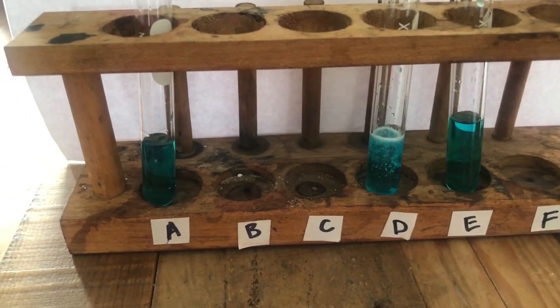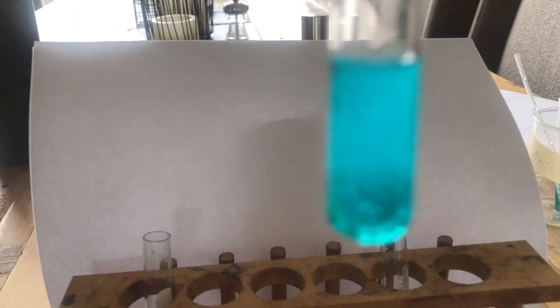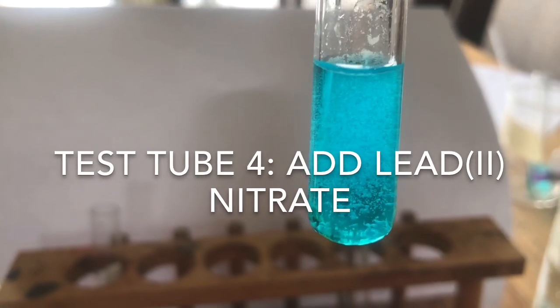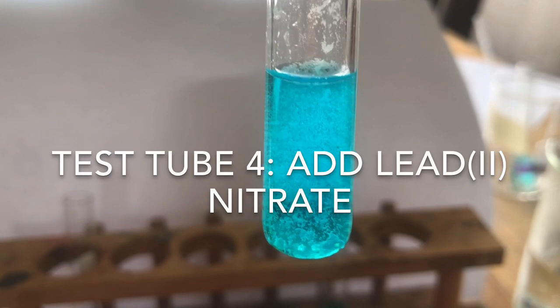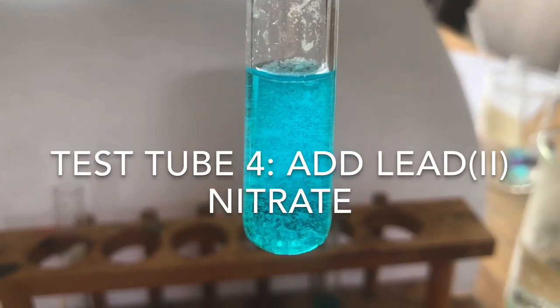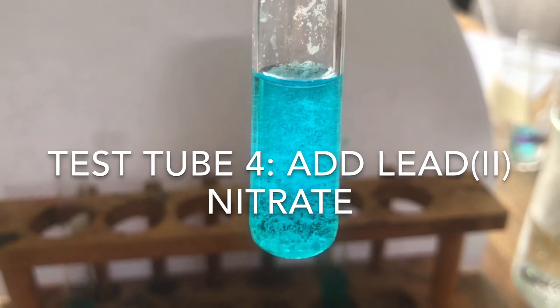the nitrate and the lead, I'm missing it here we go, react with the solution inside. What happens is the lead and the chloride combine to form lead 2 chloride, which is insoluble in solution. So you see it as a precipitate. That's that white solid that you're seeing there.